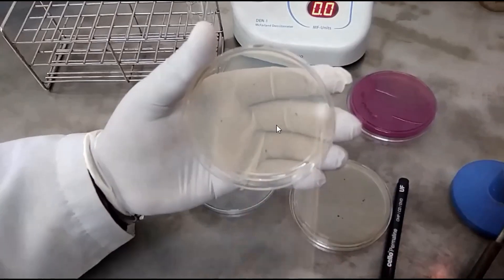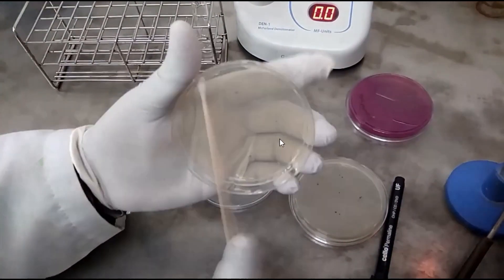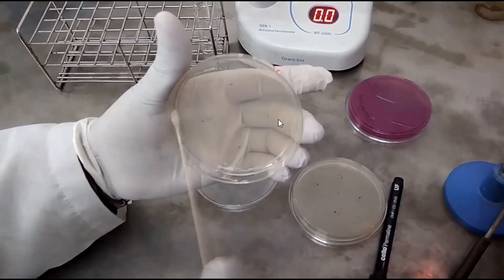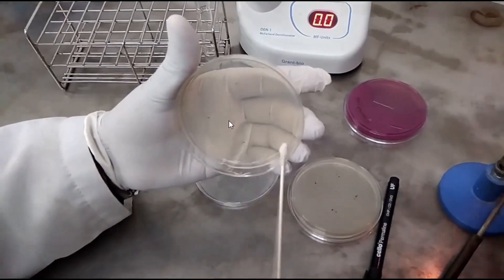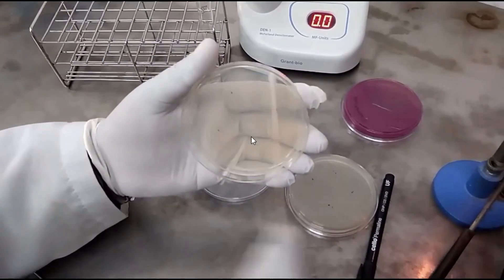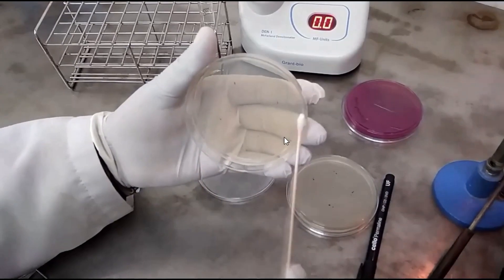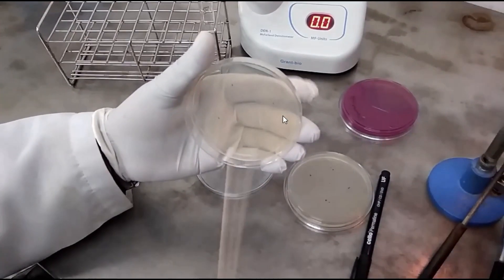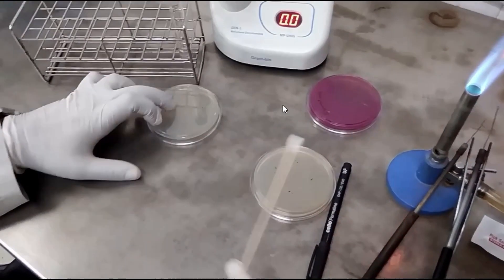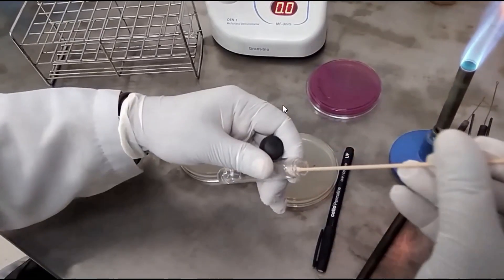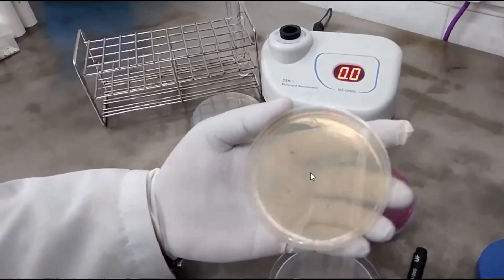Swab in this way. Rotate the plate at 60 degrees three times. In this way you will get uniform distribution of test organism. Similarly do another plate.